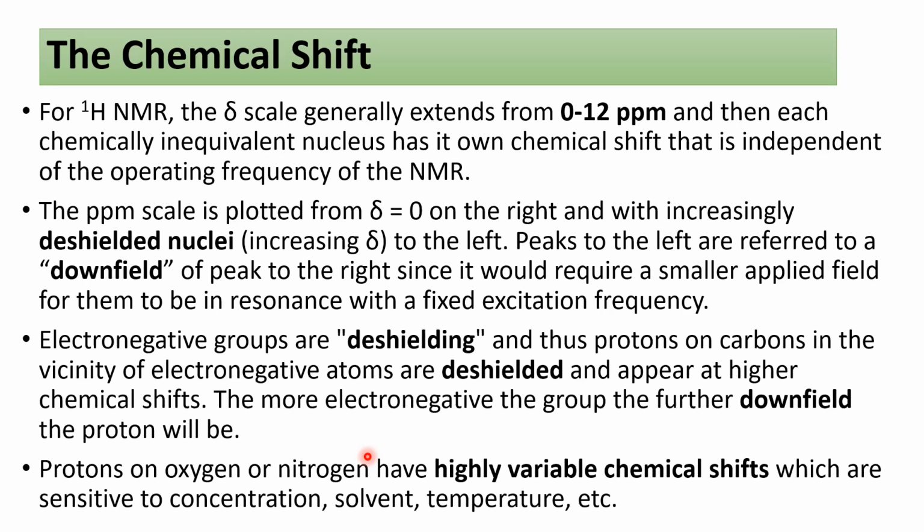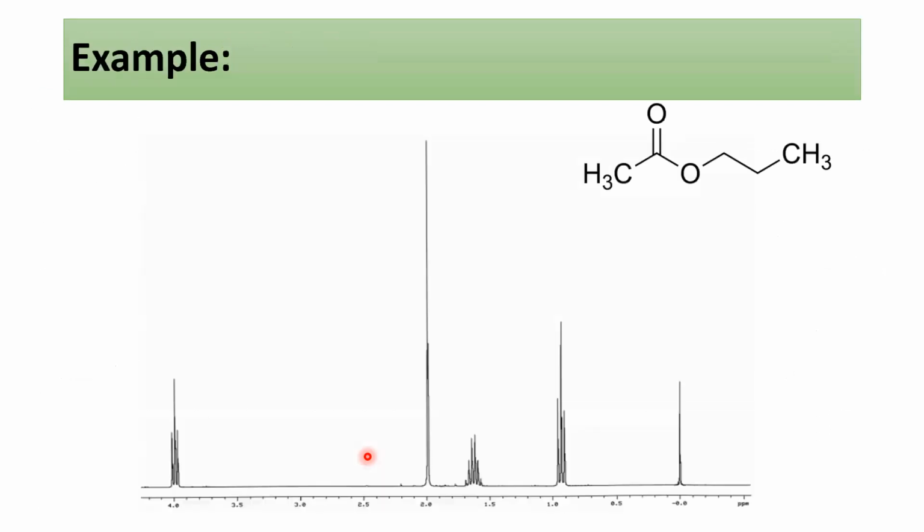Deshielded, downfield. So just remember DD, downfield, deshielded. DD, like in Dexter's Laboratory, DD the sister, deshielded downfield. If you remember that, upfield shielded is just a done deal. Done deal, DD. Deshielded downfield. All right.